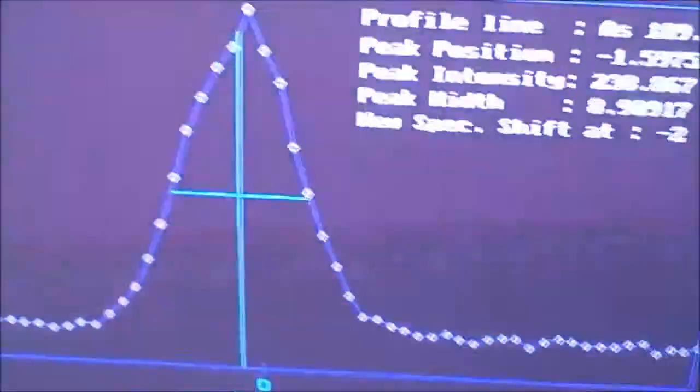Then we can see what the peak looks like. Here's the peak — that's an arsenic peak right there. What you're going to want to do is write down the intensity in the log book: 238.867. And the profile at which arsenic is occurring.